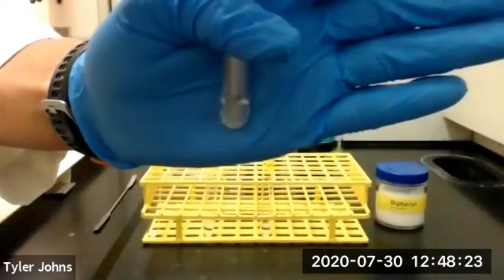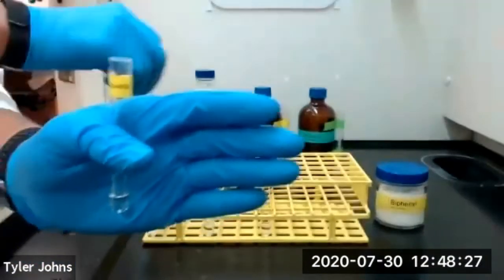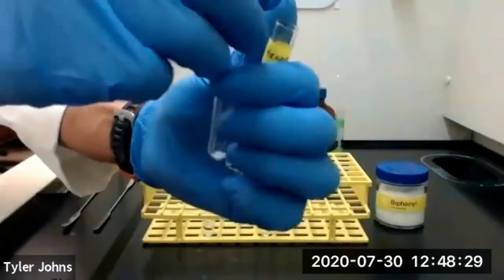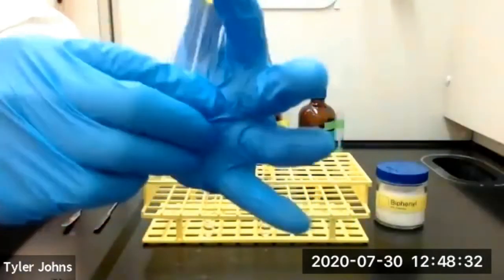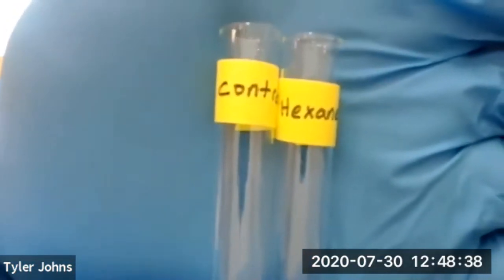Okay, so it's been about 30 seconds. We're going to remove the microspatula and we'll compare the solid biphenyl remaining in our hexane compared to our control.